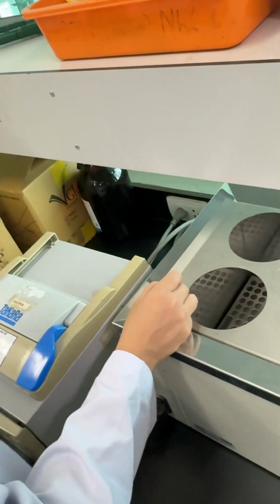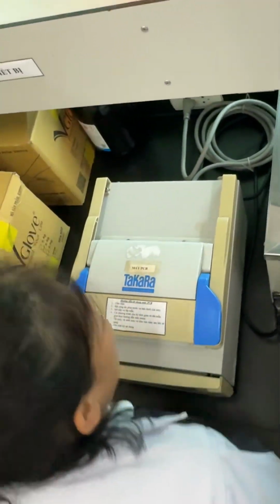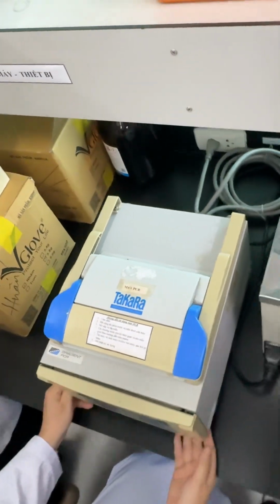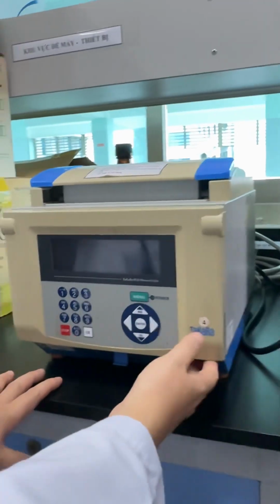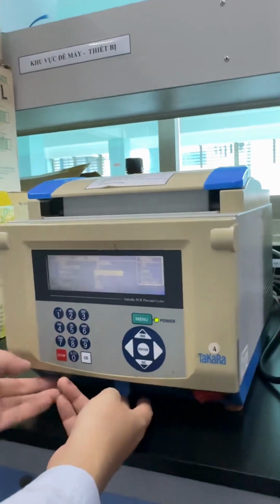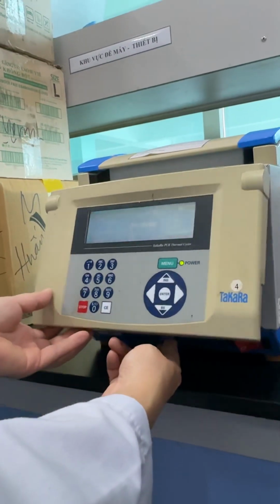Okay, so first you need to plug in the power cord, and then there's a switch on the right side, the bottom right side of the machine. Turn it on. Here is the button where you can move the screen.